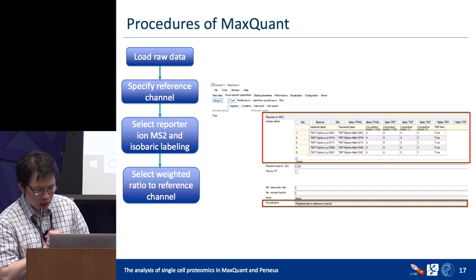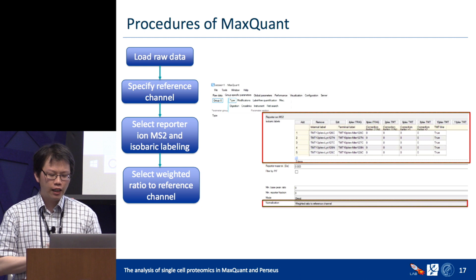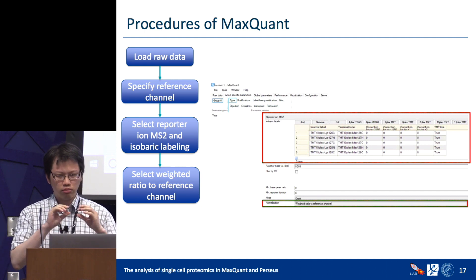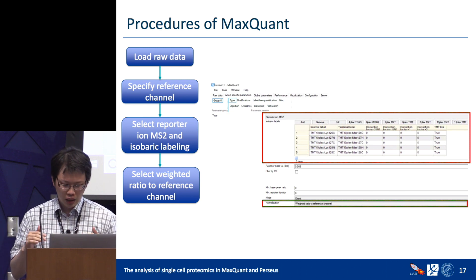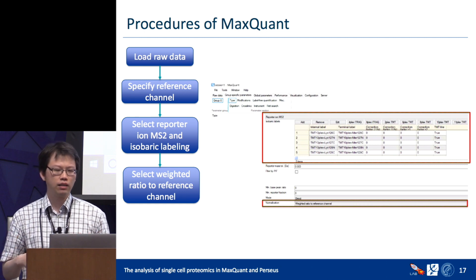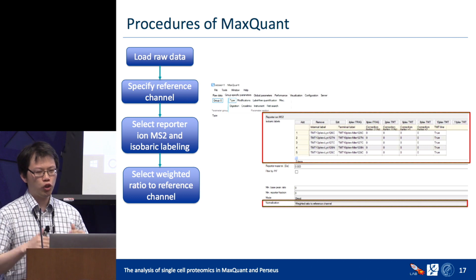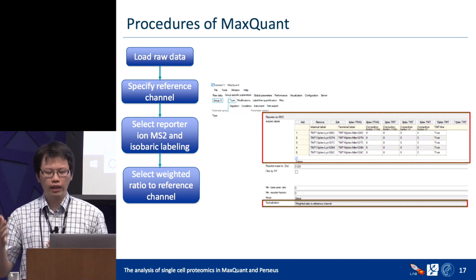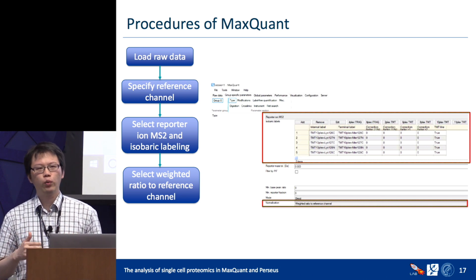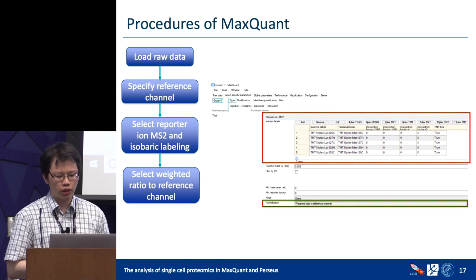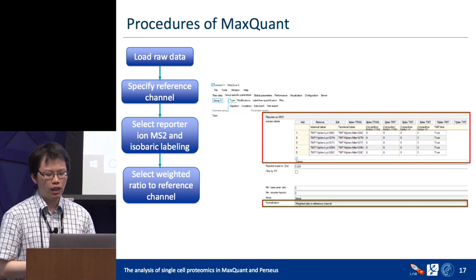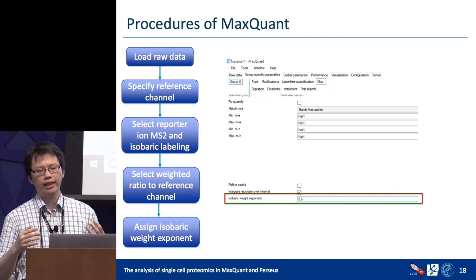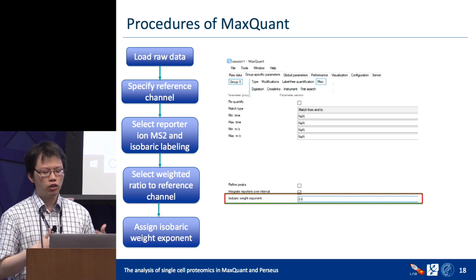Next, go to Group Specific Parameters and select the type: Reporter Ion MS2. Then choose your tag — for example, TMT 11plex — and all the information will populate automatically. You can also select which normalization to use: for PSM-level weighted ratio normalization, select Weighted Ratio to Reference Channels. To change the exponent value, go to MISC and set the Isobaric Weight Exponent — in our case, 0.6. You also need to specify your FASTA file in Global Parameters under Sequences. Then go to Identification and switch on Match Between Run. As long as Match Between Run is enabled and Reporter Ion MS2 is selected, isobaric match between run will run automatically. You can also add additional tables such as gradient states or MS2 search, then press Start.